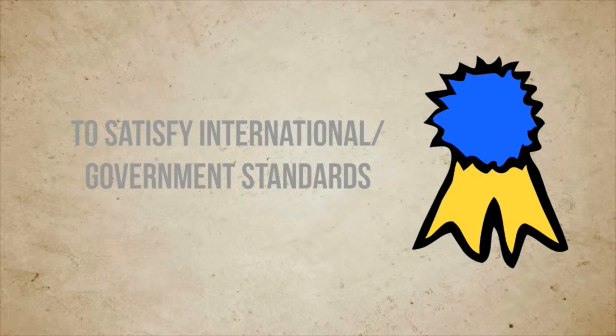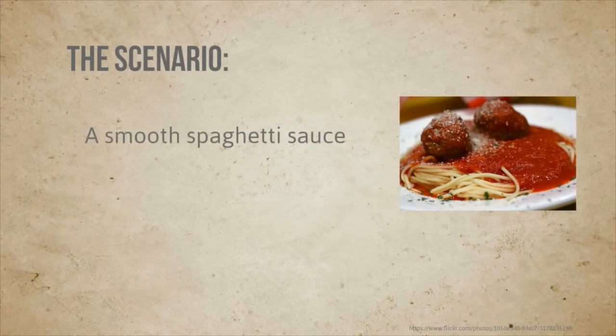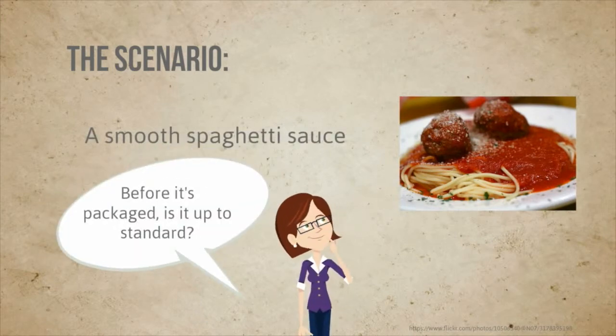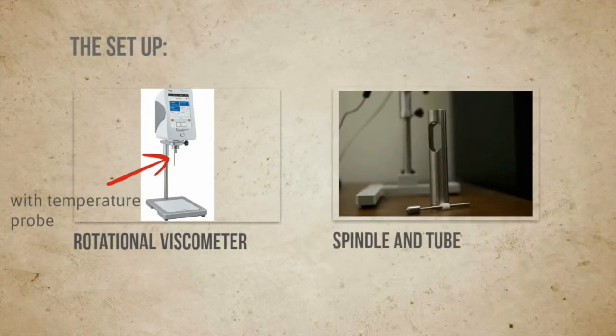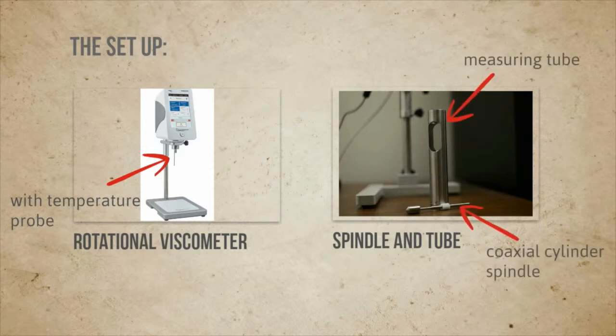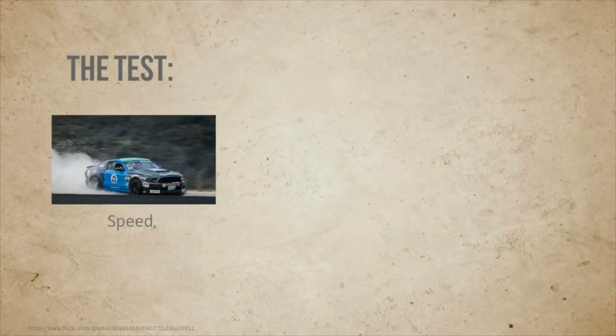Here's a little demonstration of testing spaghetti sauce. To set it up, usually a rotational viscometer is used — the temperature probe, then a spindle to spin in it, and a tube to hold the sample while the test goes on. The test should be set at a low spindle speed so the herbs and aromatics in the spaghetti sauce don't interfere with the reading. From test to test, the speed, time, and temperature should stay the same for a good comparison.